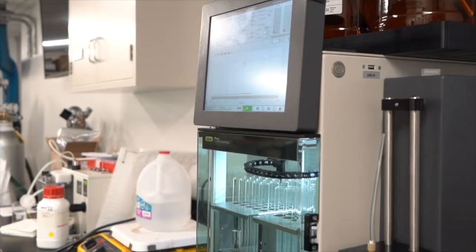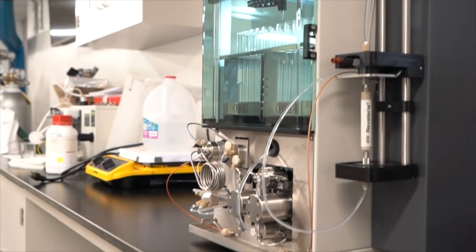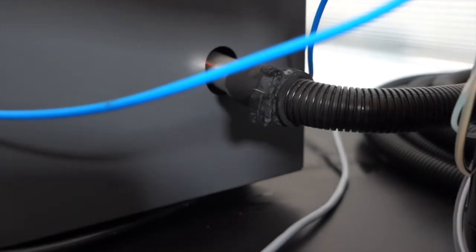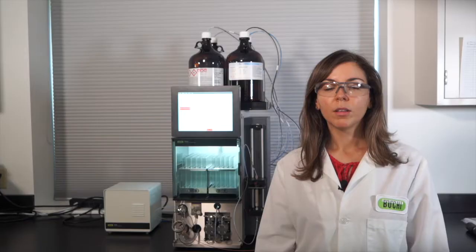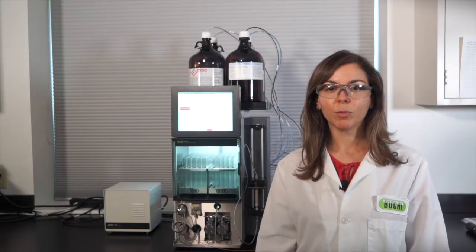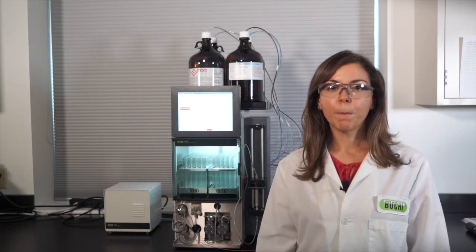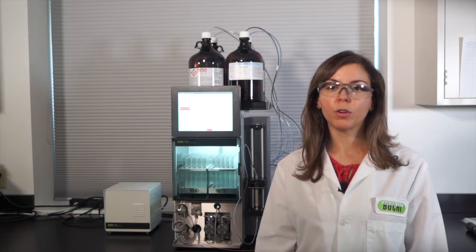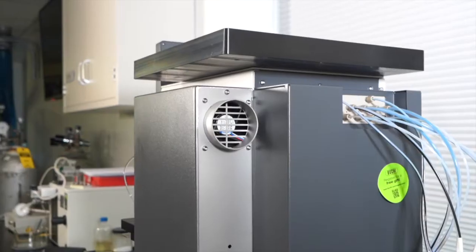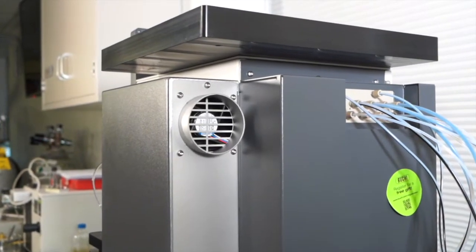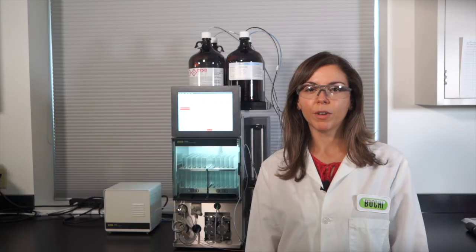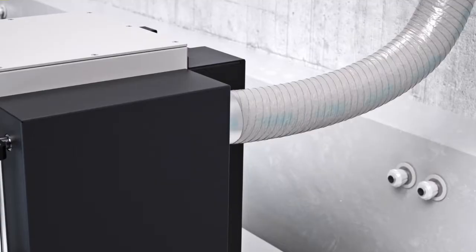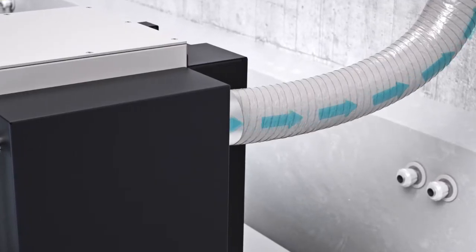For waste disposal, there is a sensor that detects when a container is full to avoid any spills in the lab. On the lower portion of the instrument, the ELSD exhaust has a hose attached to reduce signal interference. Circling back around to saving space but still focusing on safety, one of the many features that contribute to the Pure's compact design is an integrated fume hood with an exhaust vent. The convenient exhaust allows for a hose to run from the Pure to a hood or drop-down vent so all solvent fumes are properly handled, reducing potential exposure to researchers.